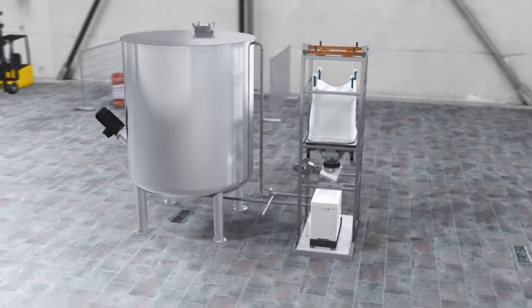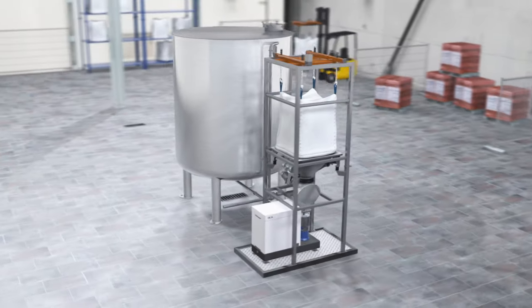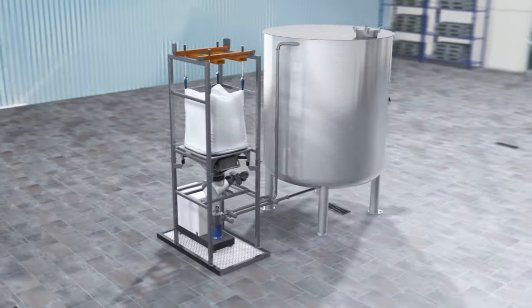In the batch process, the system draws powders into liquids and disperses it, free of dust and clumps.